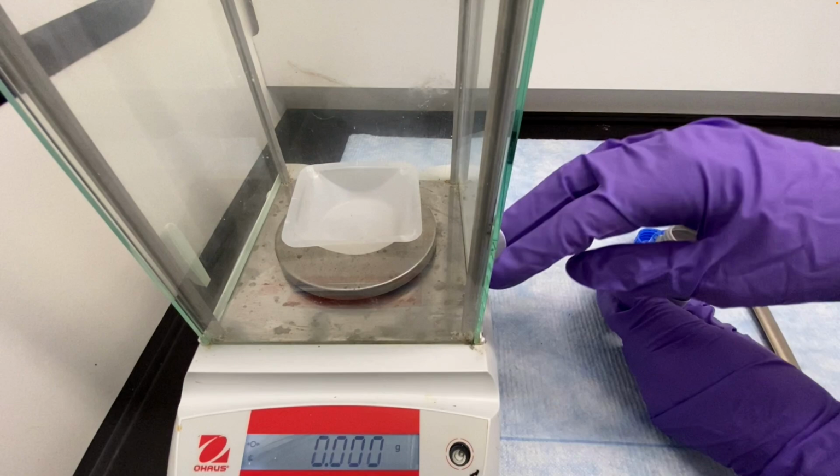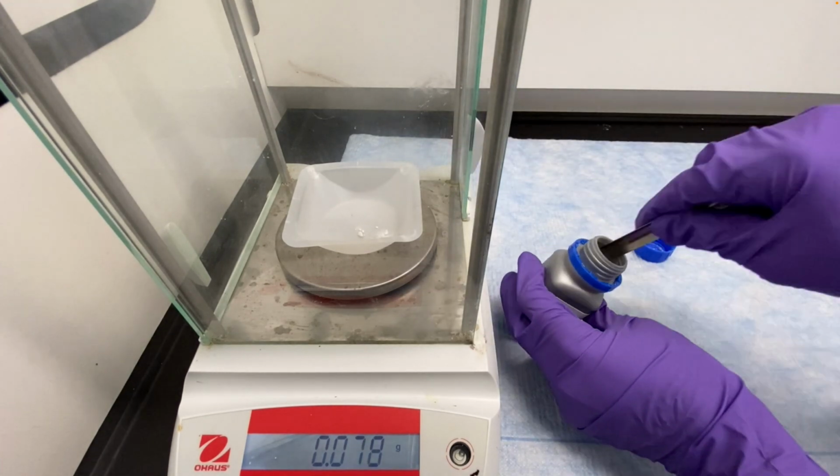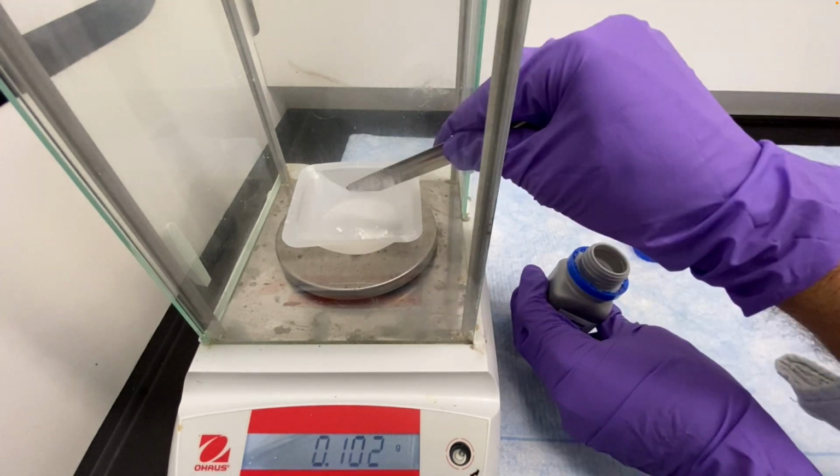So I'm going to add Borneol here, which is in this container. You'll see that the Borneol sticks a lot to the spatula that we have. And that's because this Borneol was a little old. And so if you leave these reagent containers open, the moisture in the air will get into the container, and the molecules, the solids in them, will start to clump. So if you had fresh Borneol, it wouldn't be clumping like this. Because it's clumping, it's sticking to the spatula, and as you can see here, I have to sort of dump everything on the spatula out by flipping the spatula over. But in general, you wouldn't want to do that.